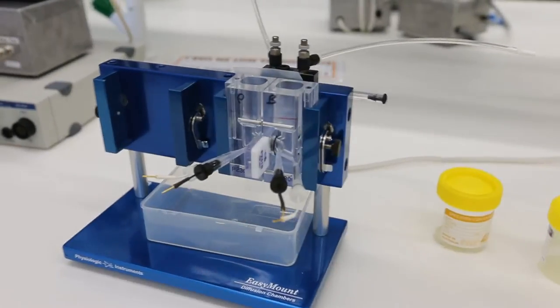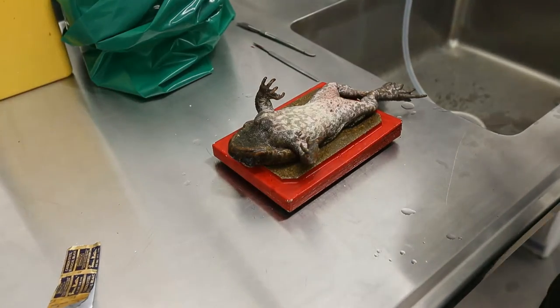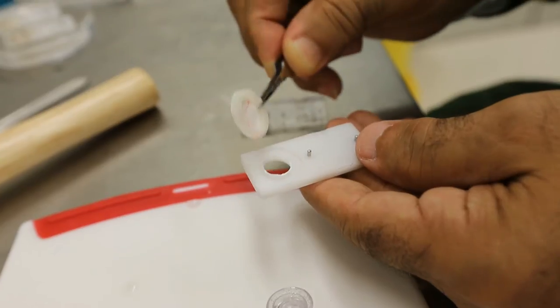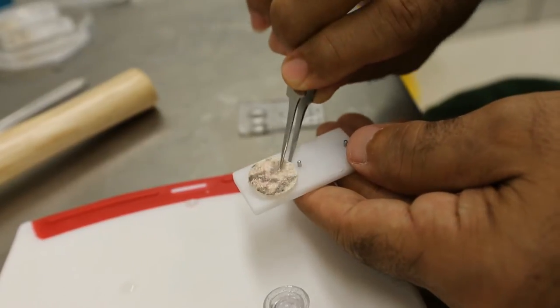In this video, we will demonstrate how to set up the equipment for the Toad Epithelial Transport Practical class. We will also demonstrate how to measure the voltage offset for the equipment.